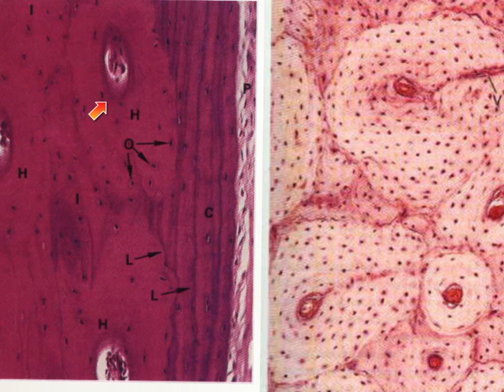What are these dots in circles around the Haversian blood vessels? They are osteocytes in lacunae. This circular part is called the Haversian system, and these lamellae are called bony lamellae.